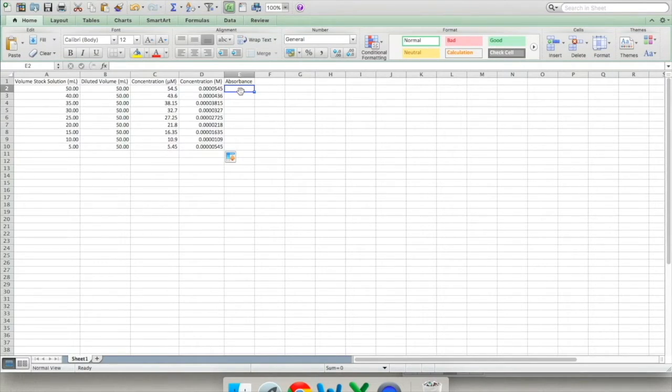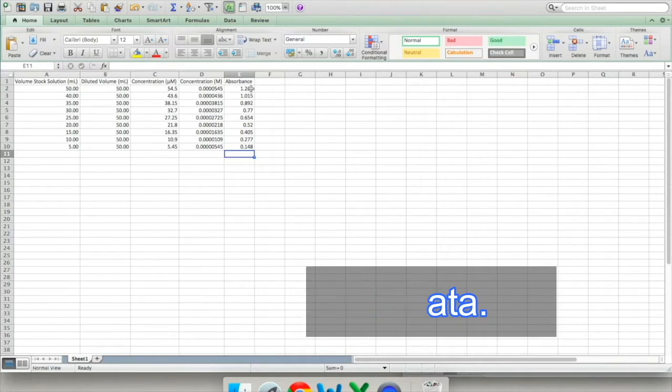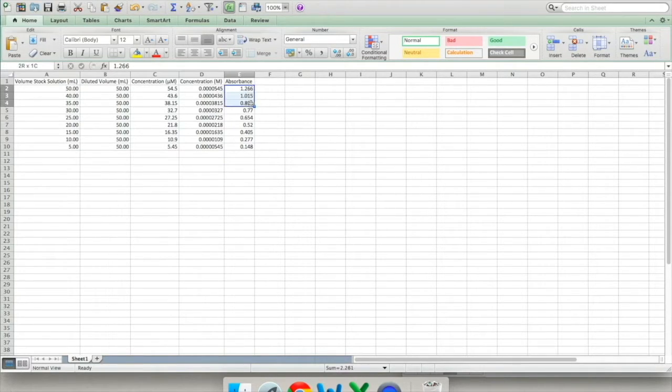It's easiest in Excel if you put the 2 columns you'd like to create a standard curve for next to one another. You'll see why in a moment. The data is given to us out to 3 decimal places, but if we try to just input this into Excel as is, the last 0 disappears. This can be solved if you'd like.